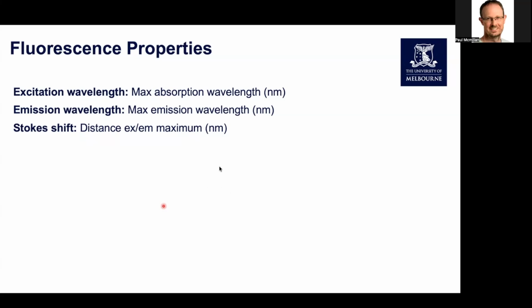And then finally, what should you match your illumination wavelength to? Again, that should be to your excitation maximum. Ideally, we want to match that wavelength that we're exciting the sample with on the system to the excitation maximum of the sample. I just realized I stopped a couple of slides early, assuming my summary would be the last one.